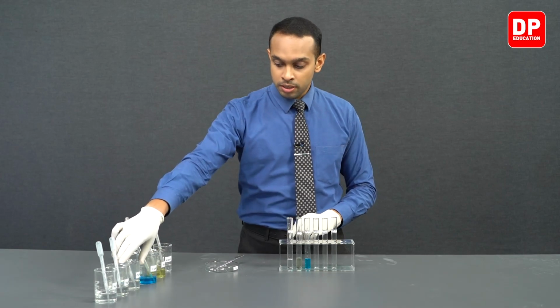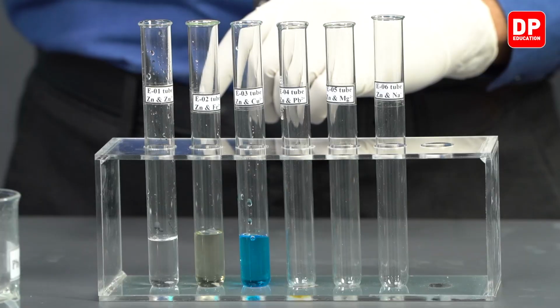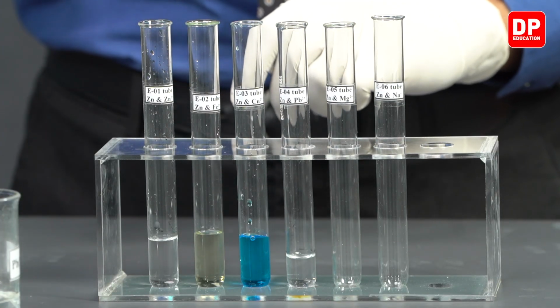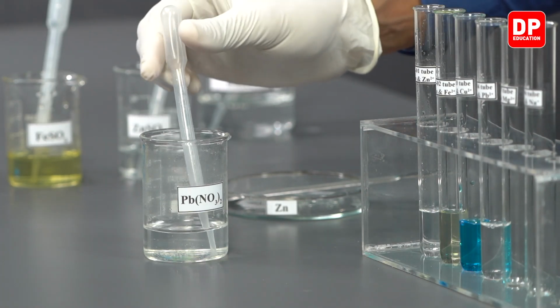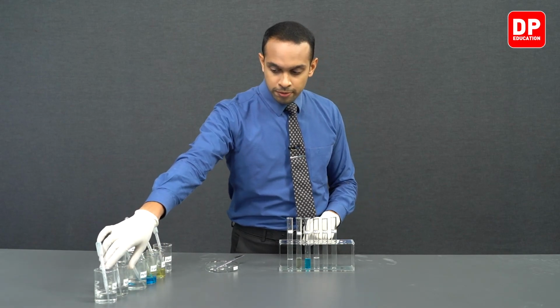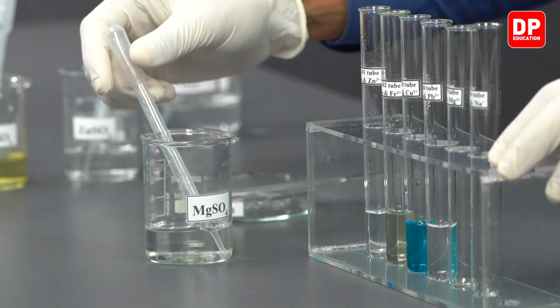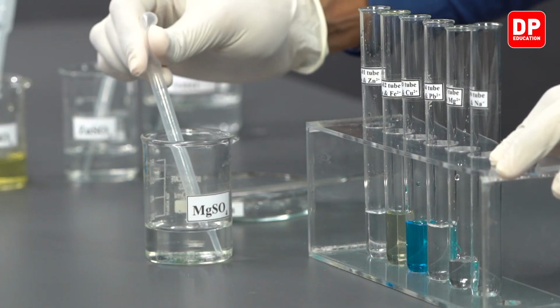And to our E4 test tube, we will add our lead nitrate solution. And to E5, labeled magnesium 2+, we will add magnesium sulfate solution.